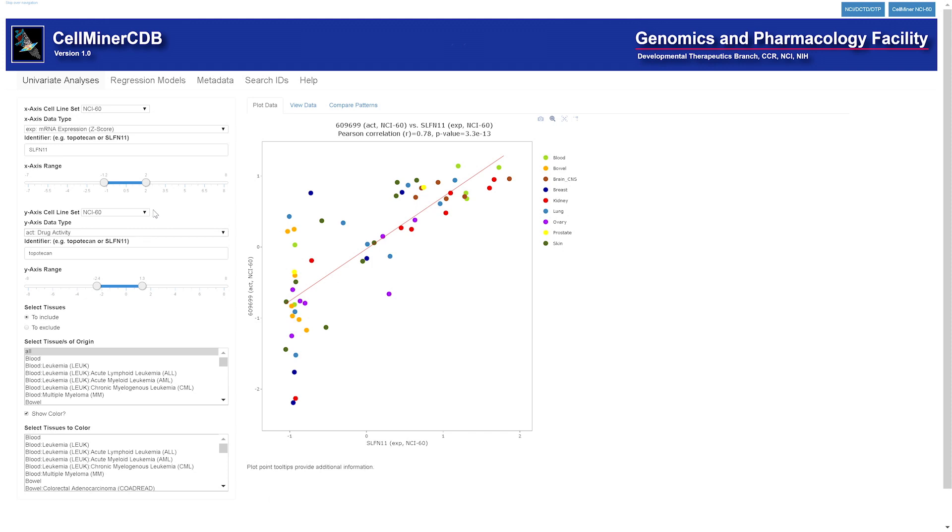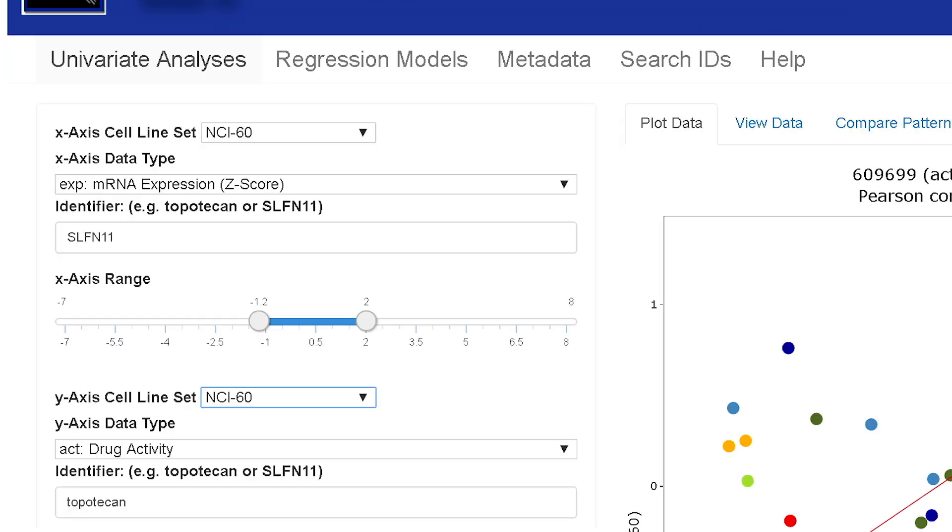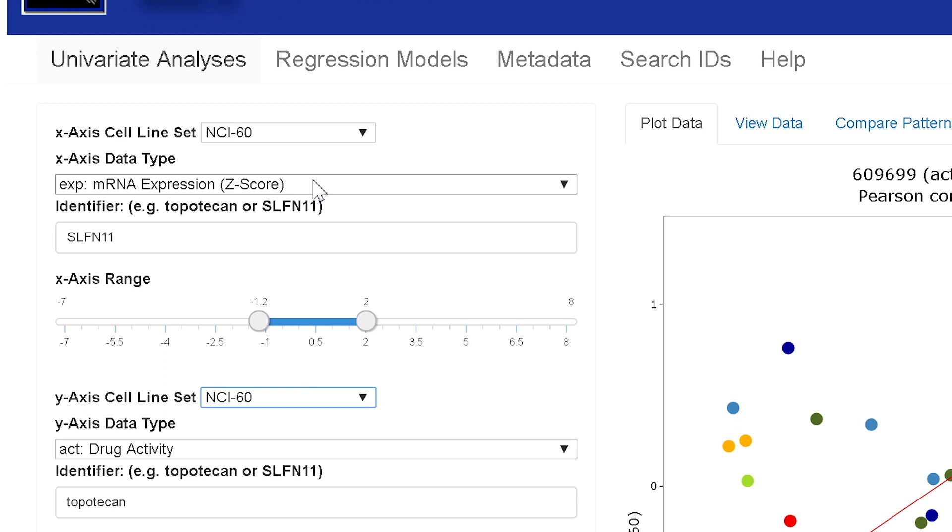So we'll start with the univariate analysis page. There's the tab for it and plot data. Our plot data default input is the gene Schlafen 11. We're looking at its transcript expression and it's being compared to the drug topotecan, its drug activity, both from the NCI-60 cell lines.